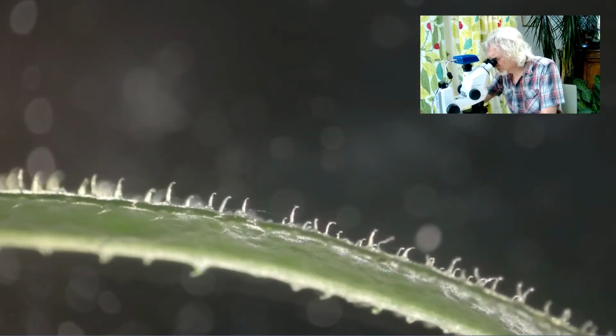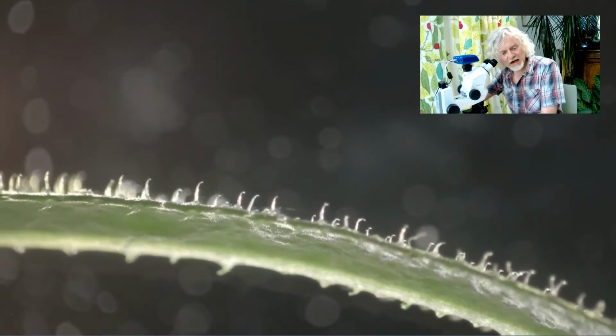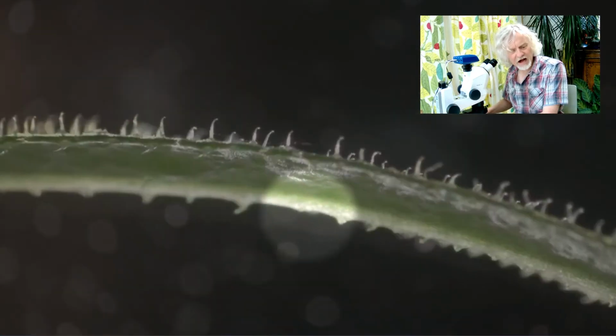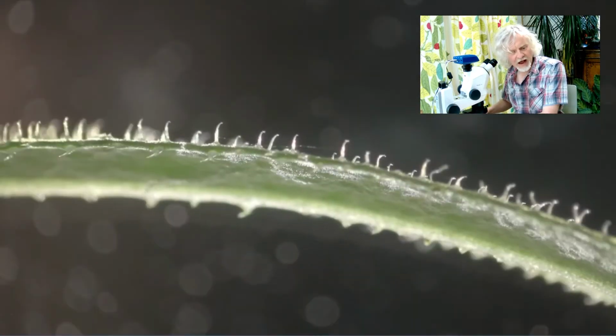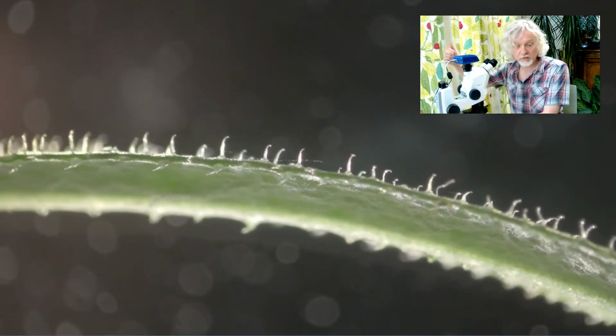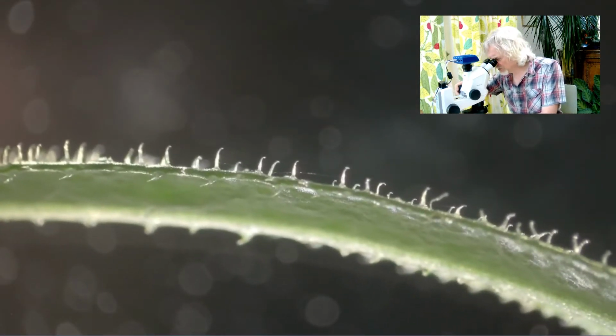I have to sort of do things with 3 hands at once. Let me get this straight. This is the underside of the leaf here, and this is the top side of the leaf. So the top of the screen is the top side of the leaf, and the bottom of the screen is the bottom side of the leaf. And if I zoom in, you can see that the top side of the leaf is covered in loads and loads of these slightly different hooked cells, okay?